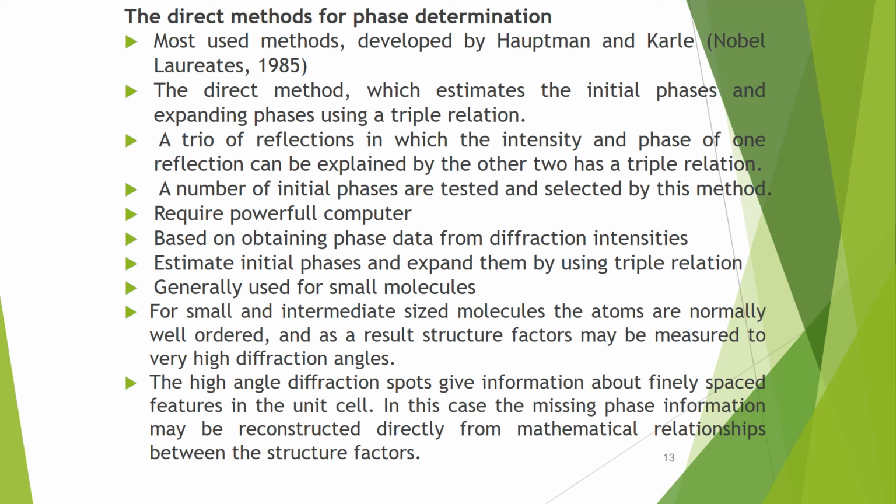The high angle diffraction spots give information about finely spaced features in the unit cell. In this case, the missing phase information may be reconstructed directly from mathematical relationships between the structure factors.